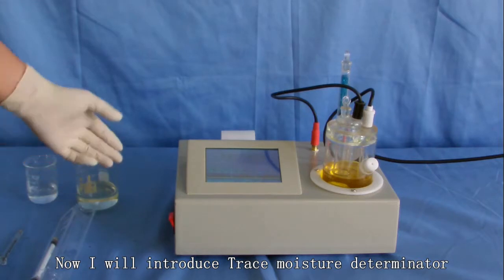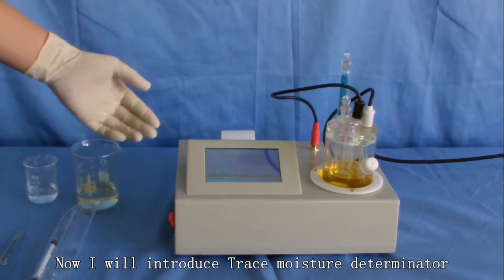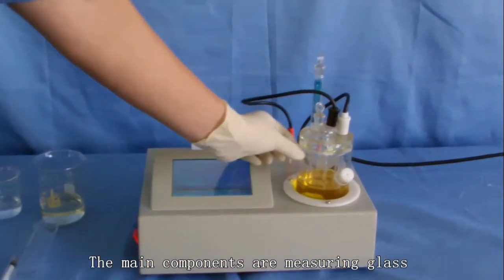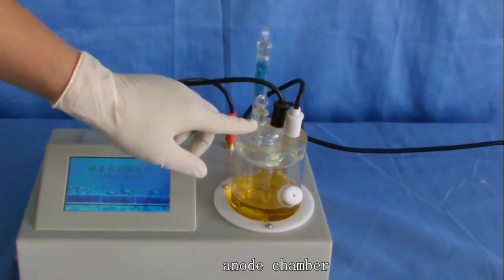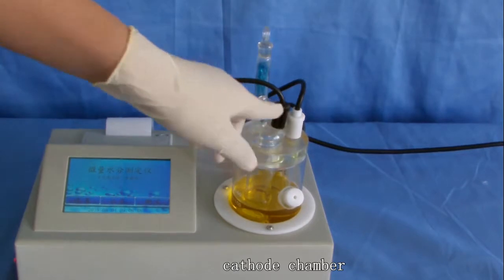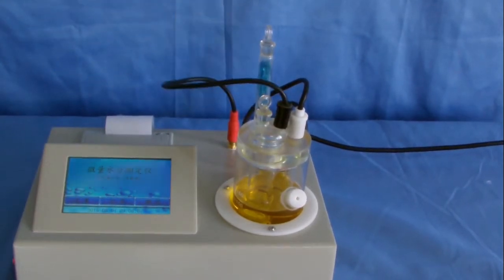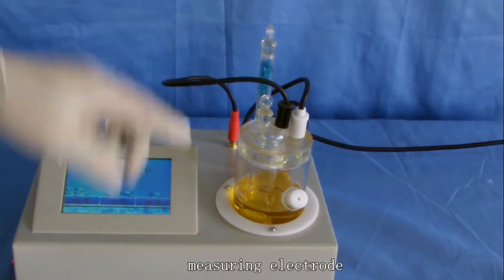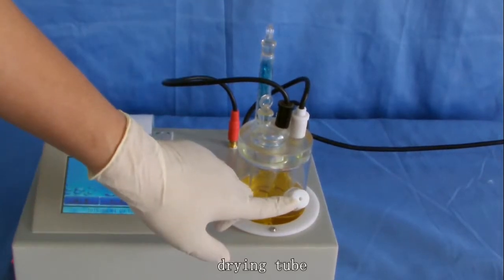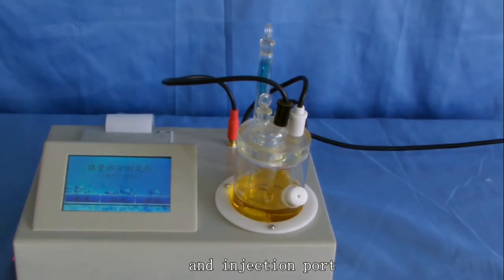Now I will introduce Trace Moisture Determinator. The main components are measuring glass, anode chamber, cathode chamber, electrolysis electrode, measuring electrode, drying tube, and injection port.